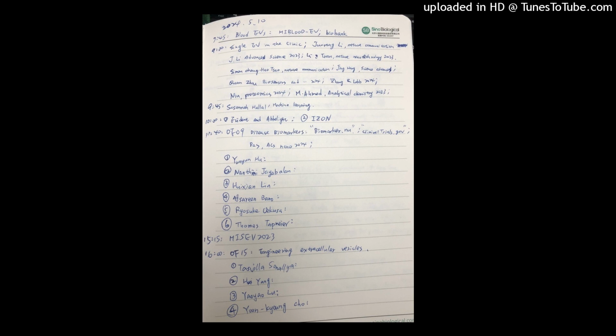And so we tried Sephadex size exclusion chromatography. We filtered off the larger vesicles and just kept the smaller ones. The only thing that seemed to be good at delivering enough material was ultracentrifugation, I'm afraid to say. I also tried Exomet. I don't know if Exomet Innovic is here at the moment. They keep trying to persuade me to try again. We'll see.